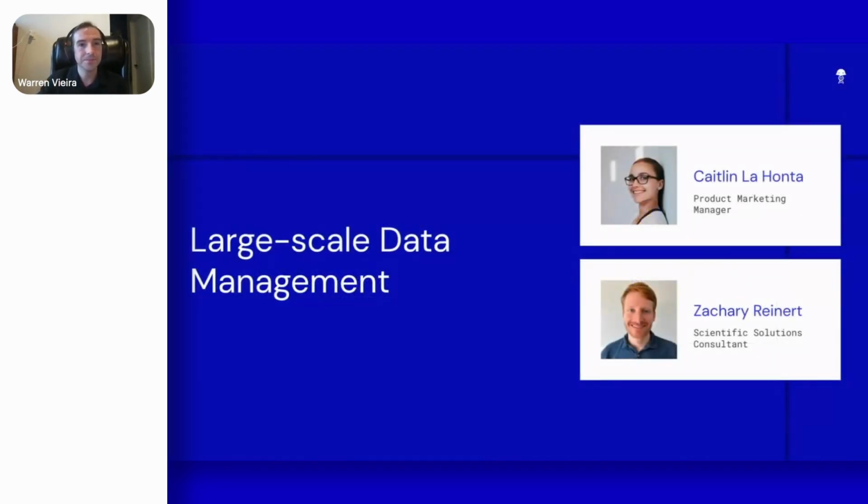Thanks, Warren. Absolutely great demo. Great to see all of that purpose-built Studies functionality with all of that data integrating right back into the R&D Cloud. In our last section, we're going to highlight some of the powerful new functionality in the Benchling platform that improves access management and using high-quality data at scale.